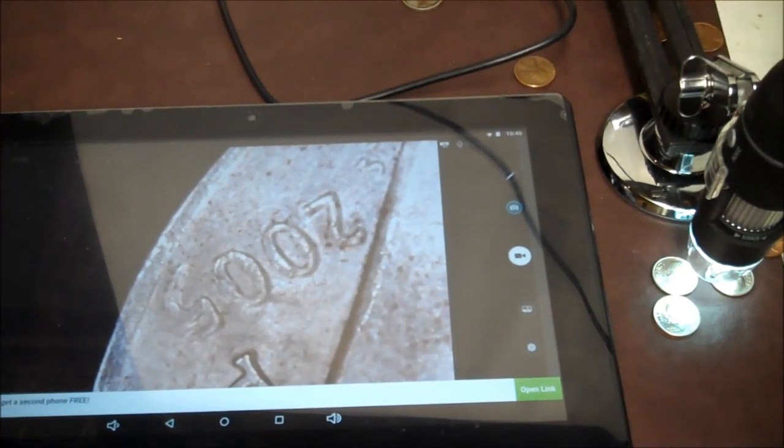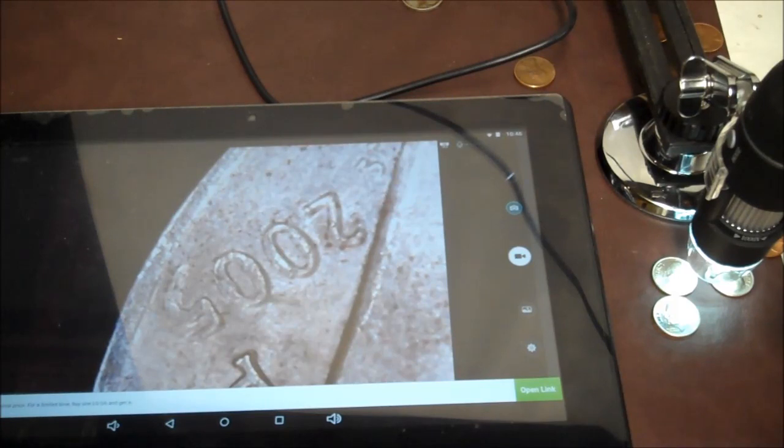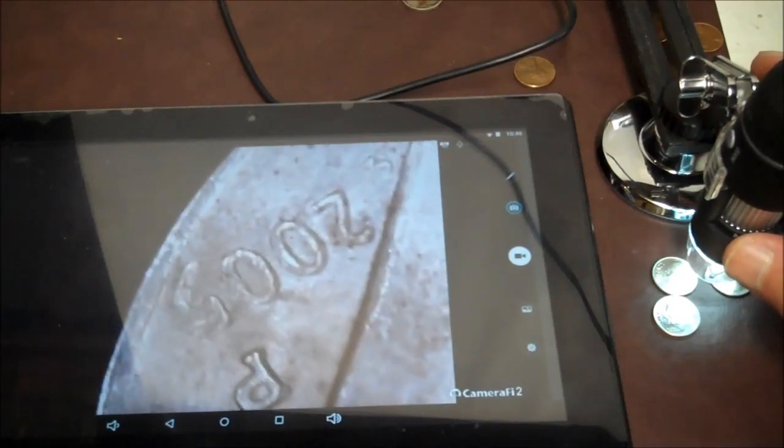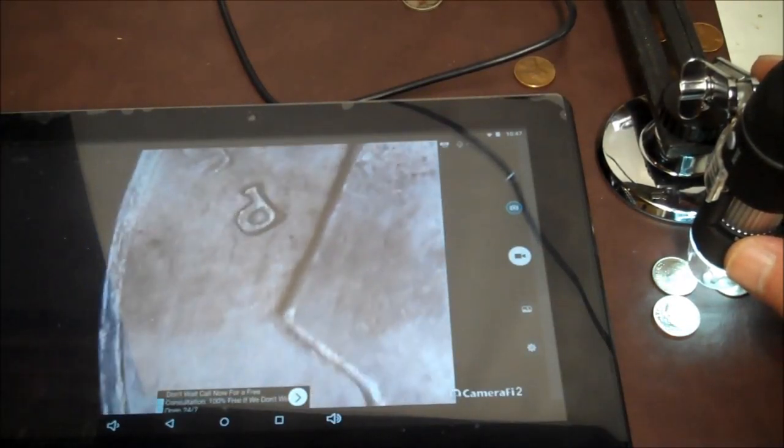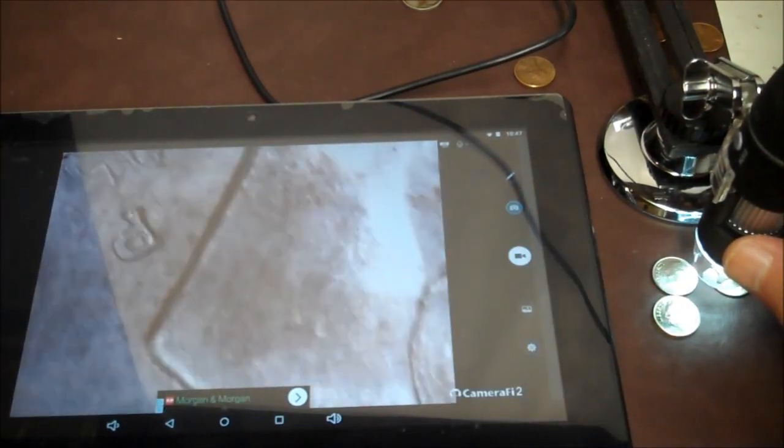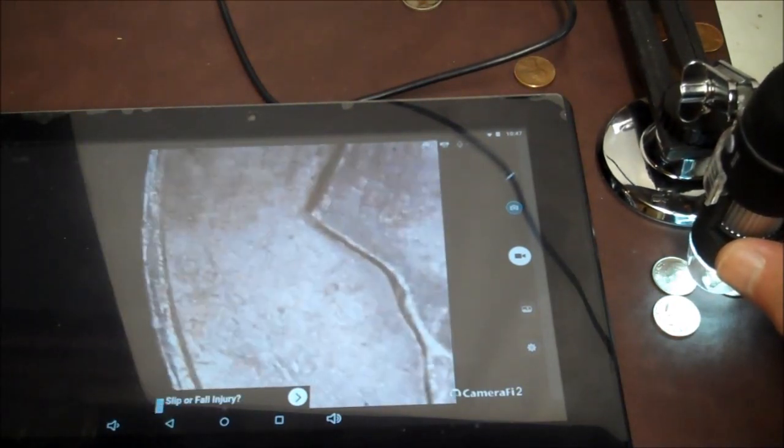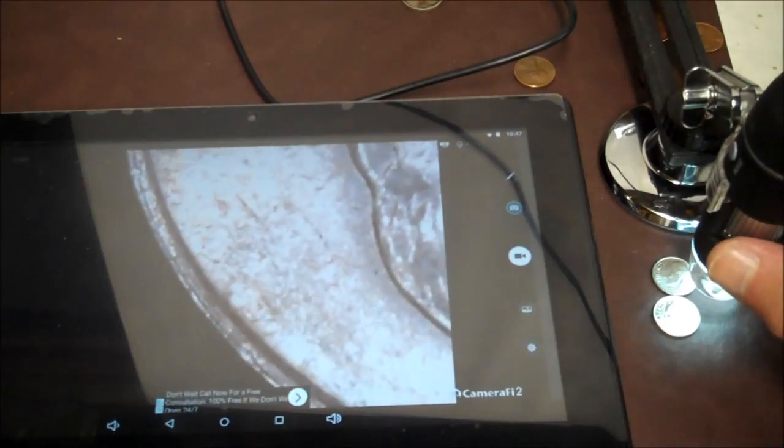Another thing is, my thing was all loose inside. So I took it apart. And be careful if you have to take it apart, because any little speck that gets on your lens, you're gonna see it. See these little specks I got here? That don't move when I move the camera? Yeah, they're on my lens. Yeah, see it? See those specks that don't move?